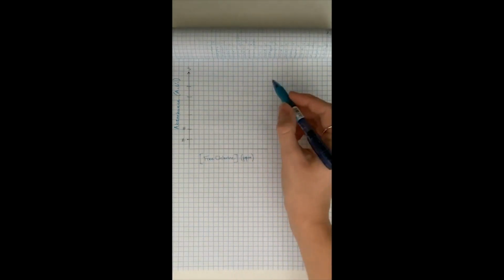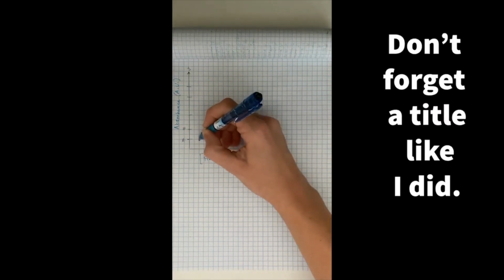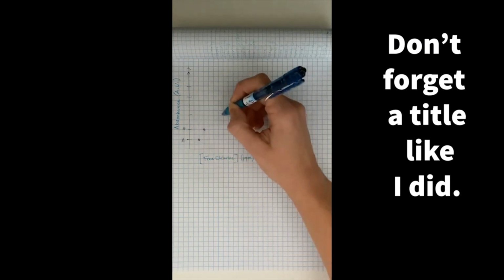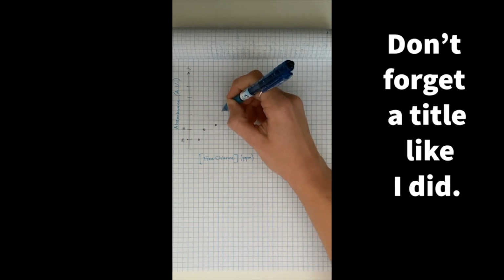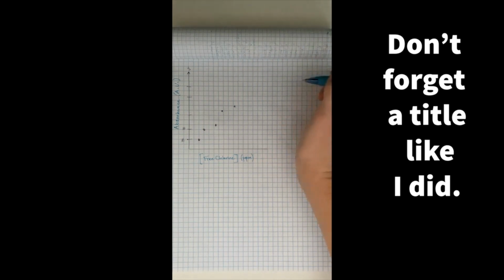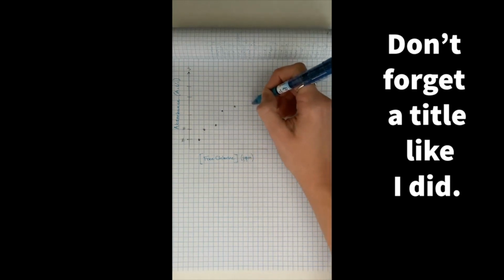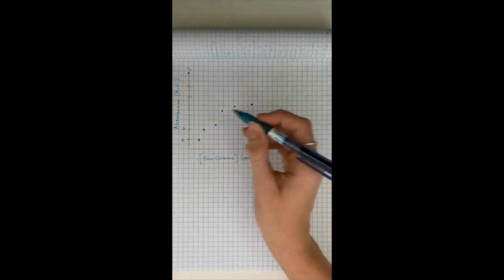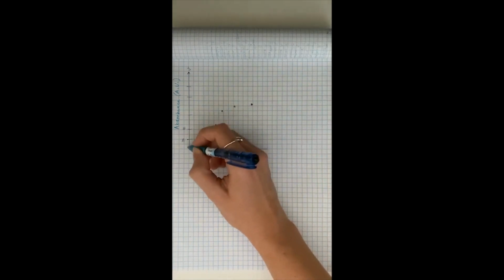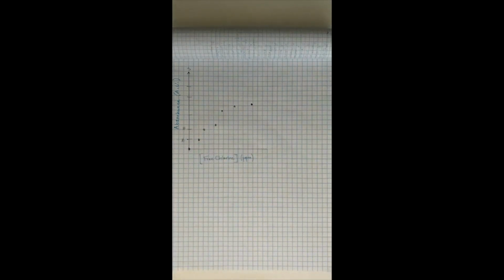Then you want to make sure you plot all 5 of your points. So I'm going to just plot some randomly. That one's pretty nice, but I'm going to add one just for teaching purposes, a little outside of the trend. And then make sure you put where your blank lies. In this experiment, our blank was at 0, which was nice. Sometimes it's a little bit higher than 0.